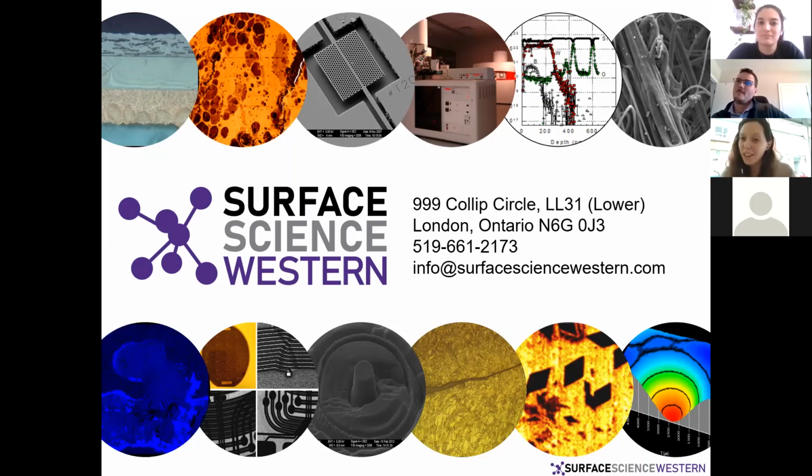And I have a final question. I'm so sorry. Sometimes I read in several papers that they don't fit multiplets for transition metals like iron or manganese. Normally they use one huge area containing like three multiplets. Is that correct? Can we do that, or what kind of information can you lose?